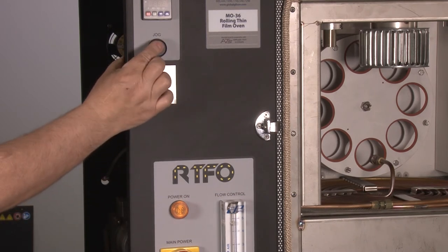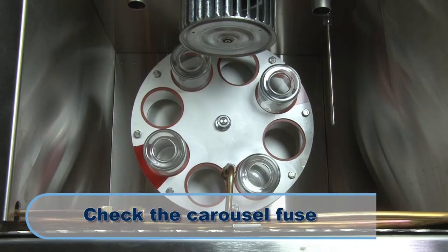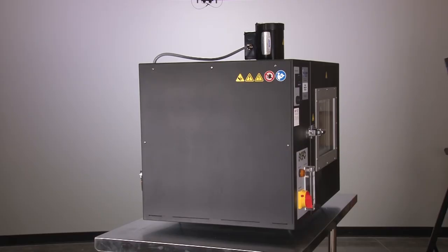If the carousel does not rotate, you need to check the carousel fuse. To check the carousel fuse, you need to remove the side panel.